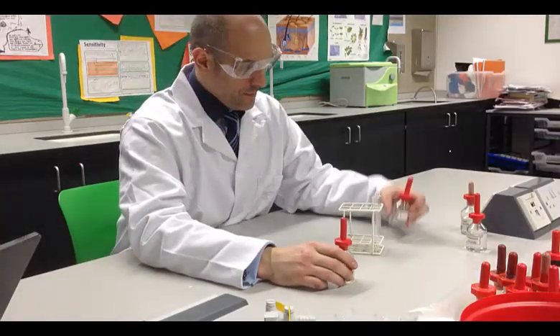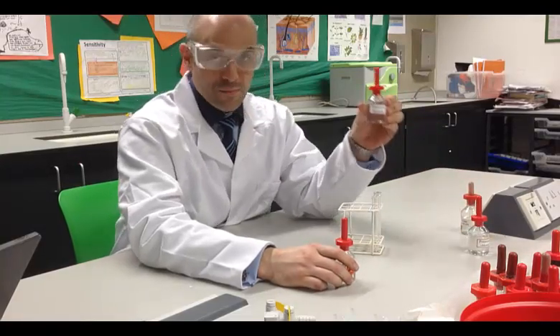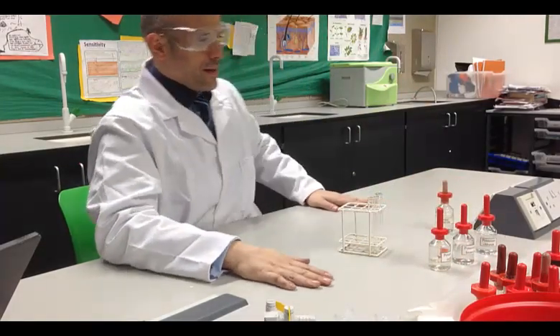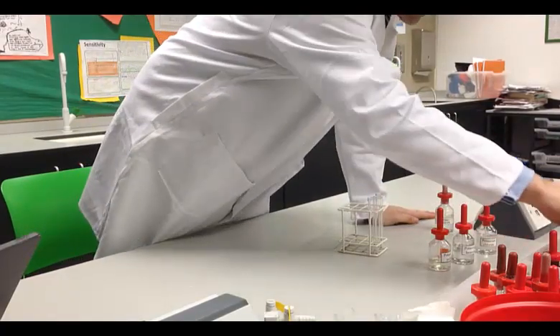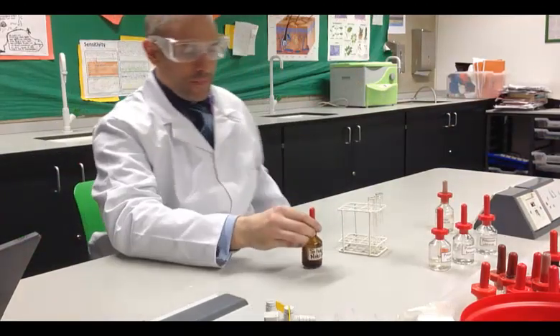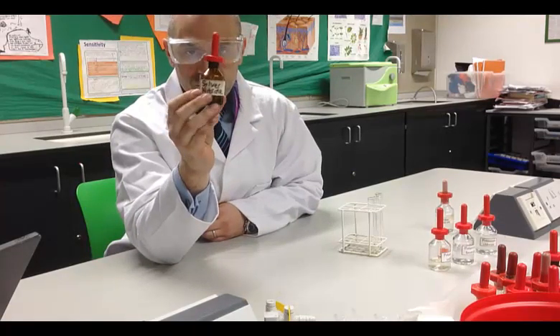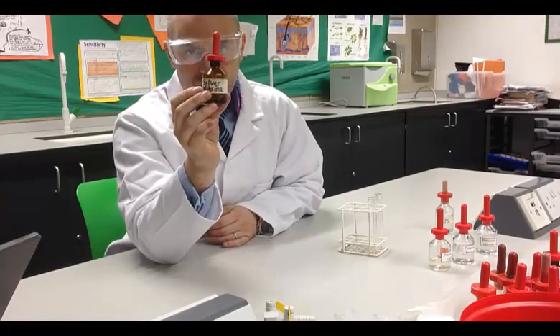Right, I'm going to be using potassium chloride, potassium bromide, and potassium iodide, some nitric acid, and the test reagent, silver nitrate. Notice how it's in a brown bottle. Okay, it's in a brown bottle to protect it from the light, because light can cause the silver ions to reduce back into a metal, which basically makes it go off.